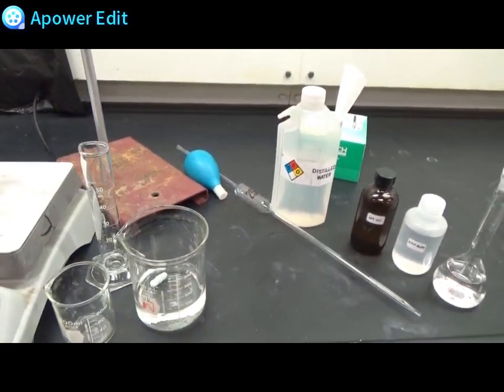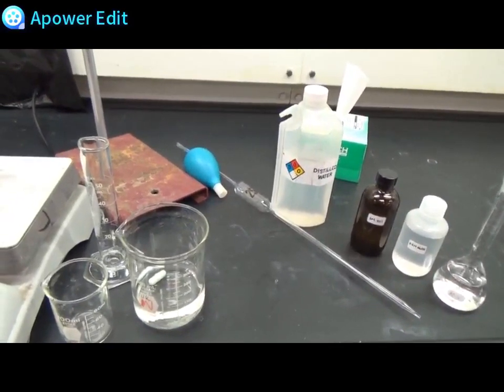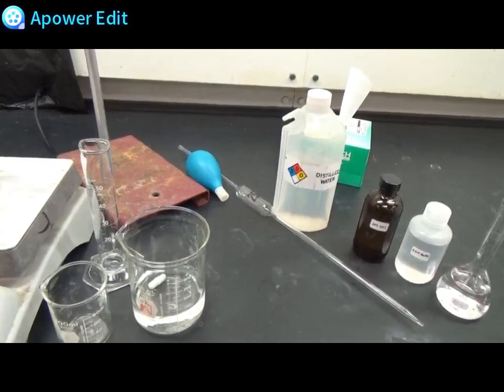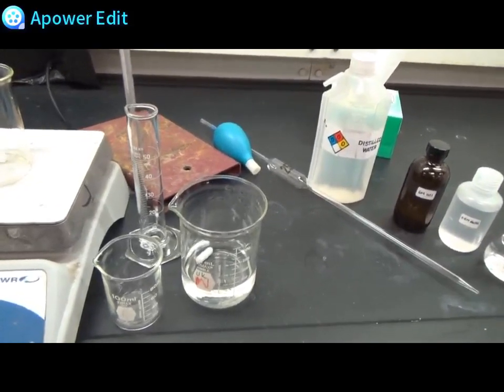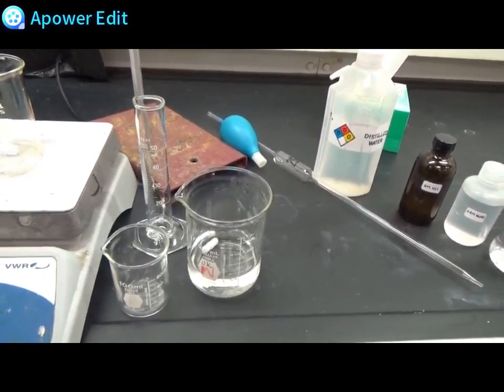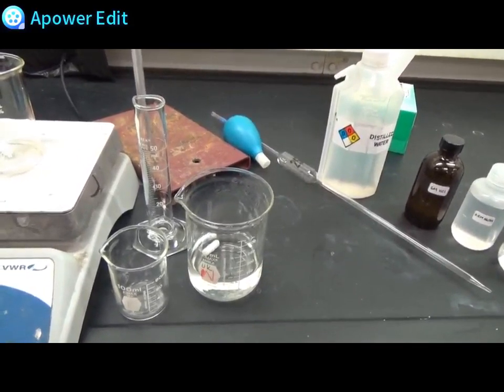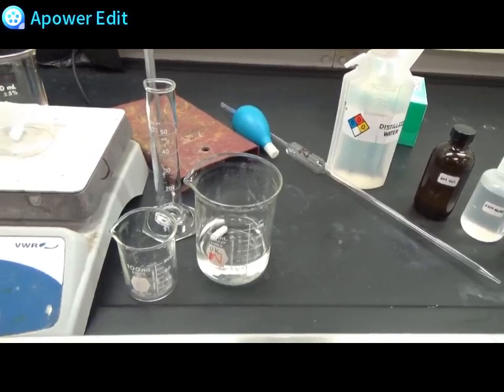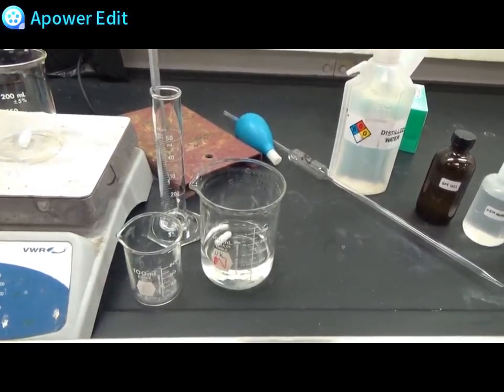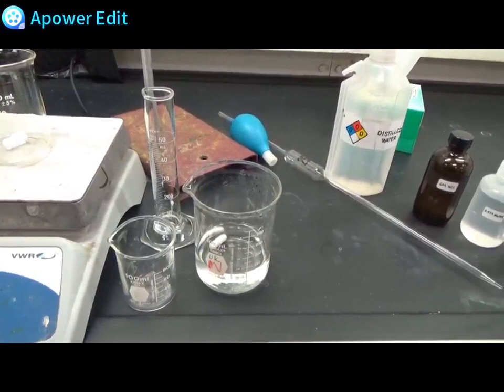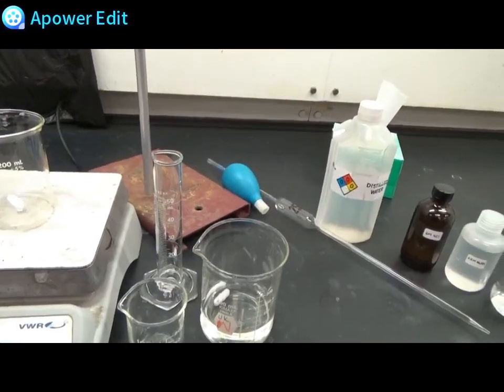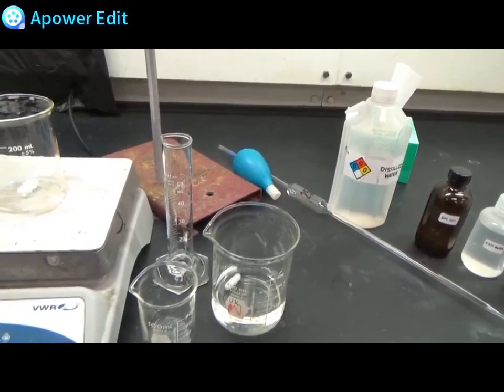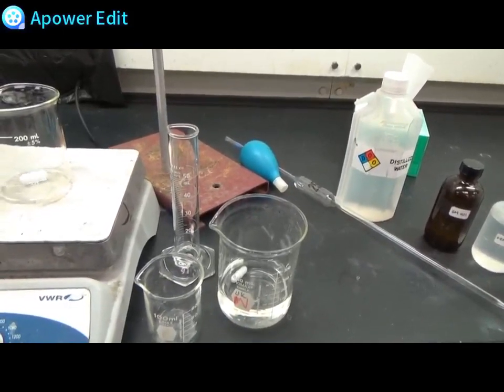The glassware that you will need include a 25 ml volumetric pipette with a rubber bulb, a waste beaker, a 400 ml waste beaker should be enough, a 100 ml beaker to separate your acidic solution from the stock, and a 25 or 50 ml graduated cylinder.